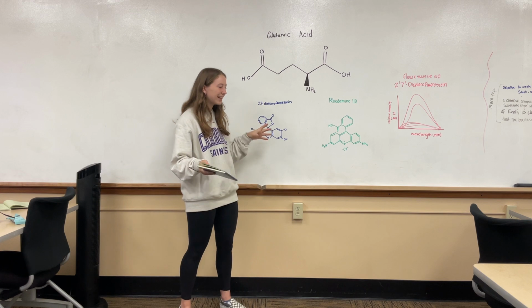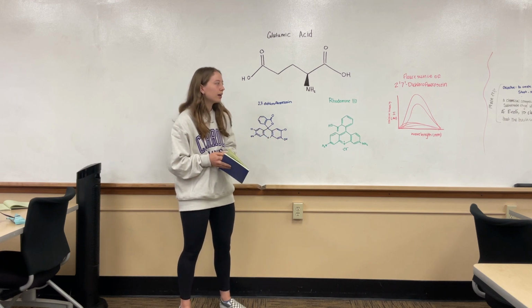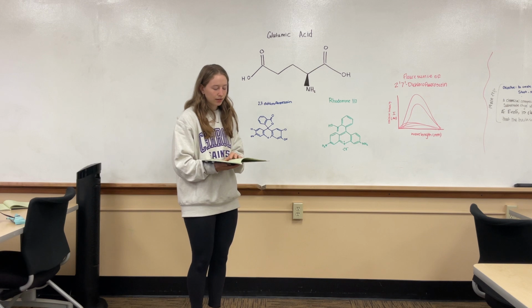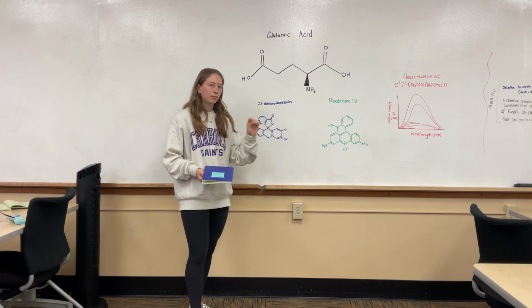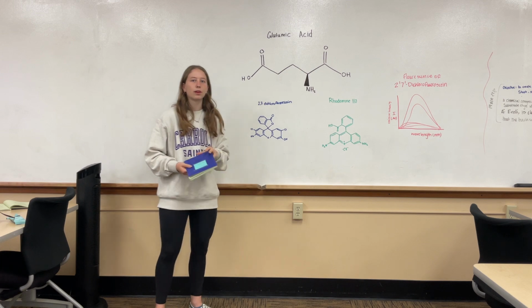Then we compared them and made sure they would come up at about the same fluorescence as well. That's our general procedure, as well as how we overcame some of the problems we encountered. We're going to be working backwards from there, coming up with concentrations from our data that we collected via UV-vis and fluorometer.